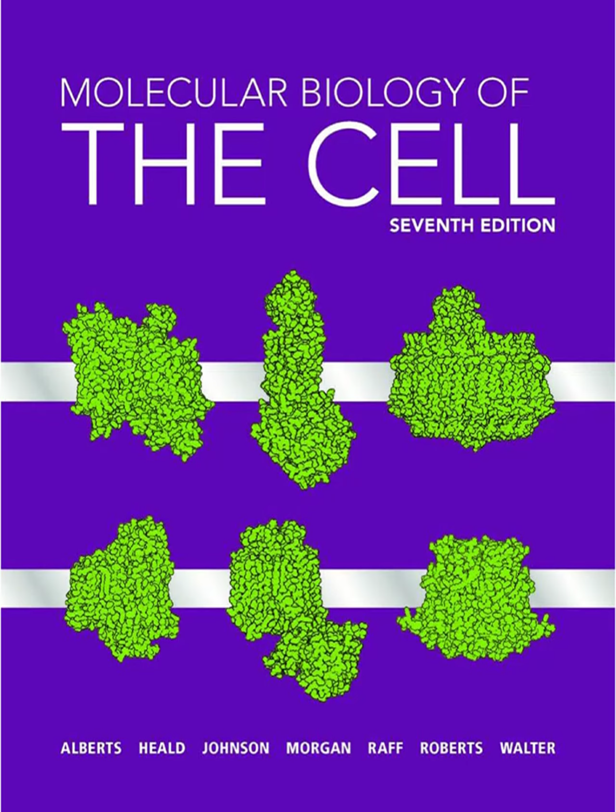Okay, labels locked into the gel. Then you digest away the actual biological material, the proteins and lipids, leaving behind the labels embedded within this gel scaffold, like ornaments hung in space. Wow. Finally, you add water. The gel swells up isotropically, meaning equally in all directions, expanding maybe fourfold or even tenfold or more. So everything just gets bigger but stays in the same relative position? Exactly. Features that were originally, say, 70 nanometers apart, below the diffraction limit, might now be 280 nanometers apart after 4x expansion. Now you can easily resolve them with a standard confocal microscope.